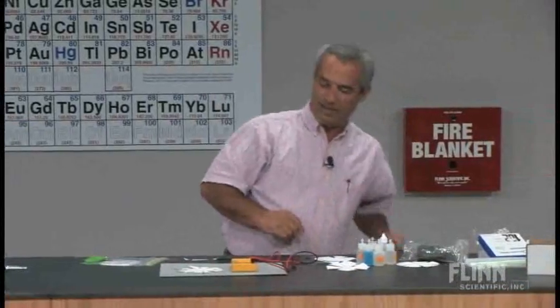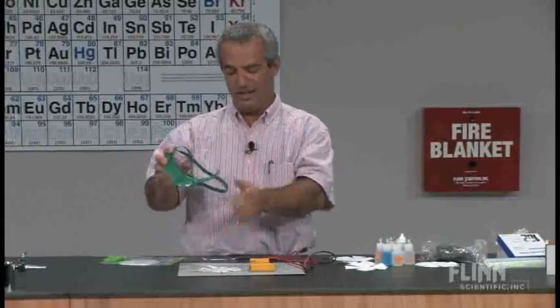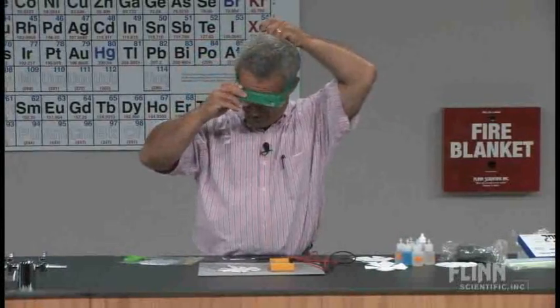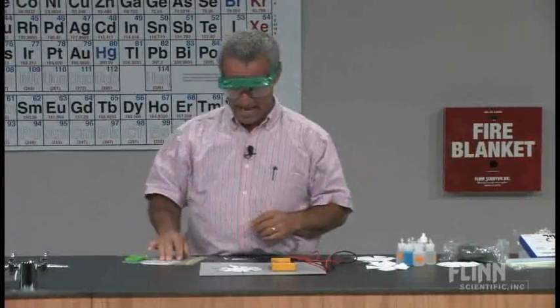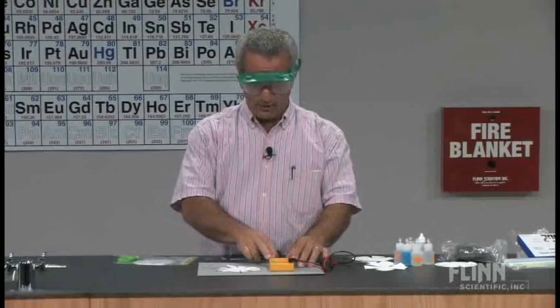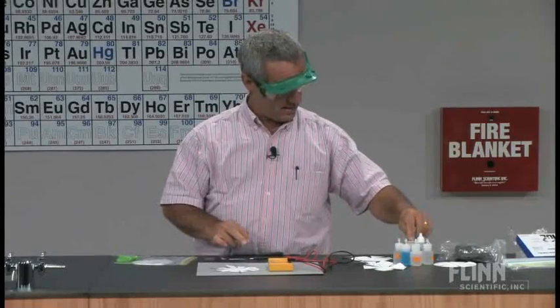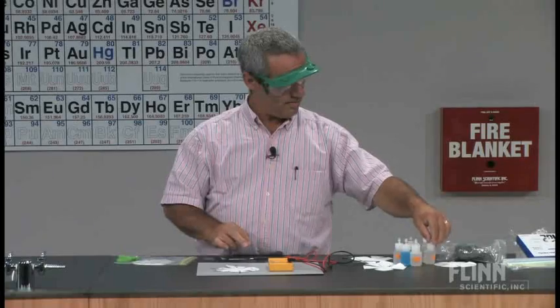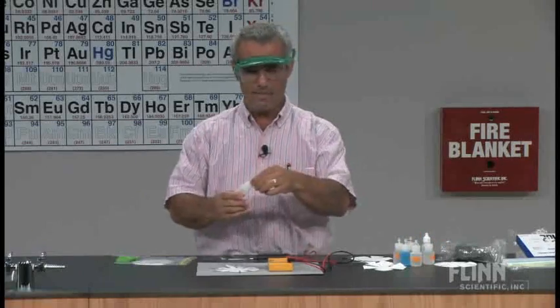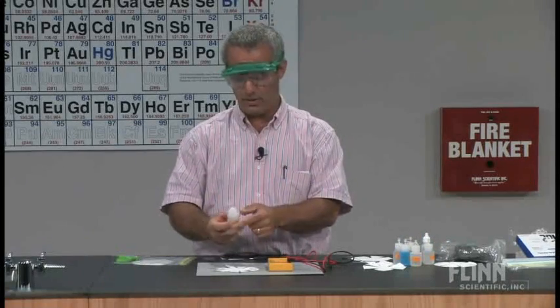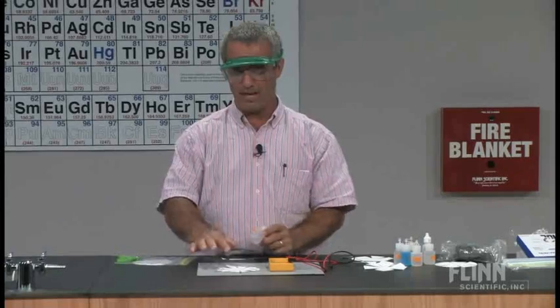So they're good to go now. I'm good to put on my goggles because now the chemicals come out. You could argue the metals were chemicals to begin with, but now the solutions come out. We've got a little voltmeter here. I'm going to start by taking about four or five drops of each of these solutions. The first is potassium nitrate.